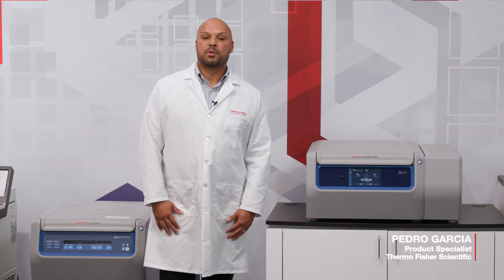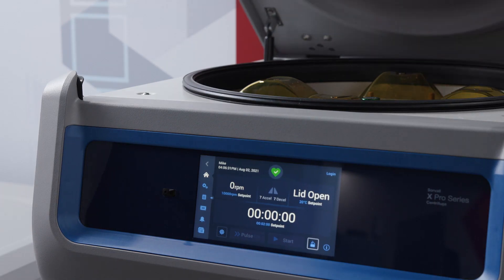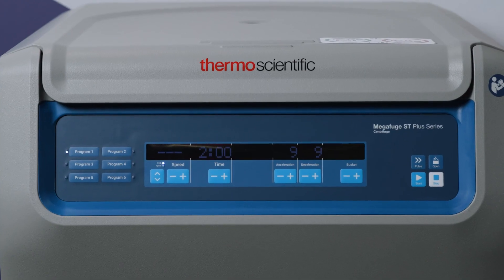Hello, my name is Pedro Garcia. I'm a product specialist for centrifugation with Thermo Fisher Scientific. Today I'm here to highlight some of the differences between our X4 centrifuges and our ST4.